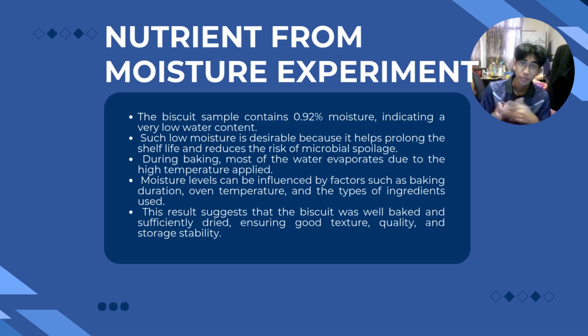So, the biscuit sample contained 0.92% moisture, indicating a very low water content. Such low moisture is desirable because it helps prolong the shelf life of the biscuit and reduce the risk of microbial spoilage, because microorganisms need water to reproduce.